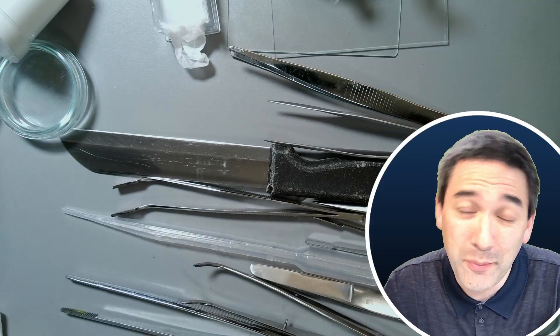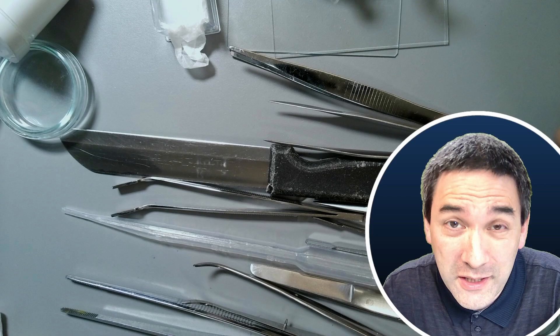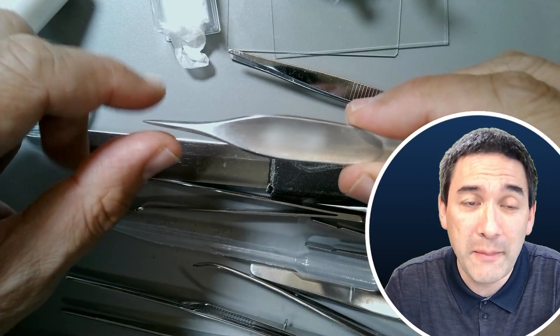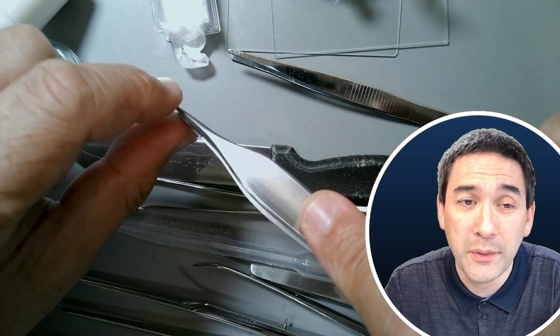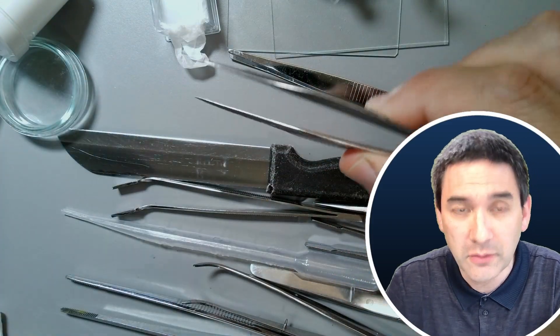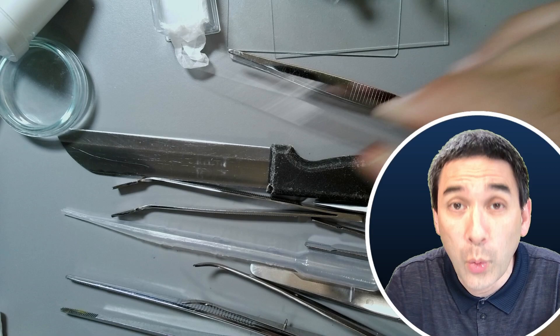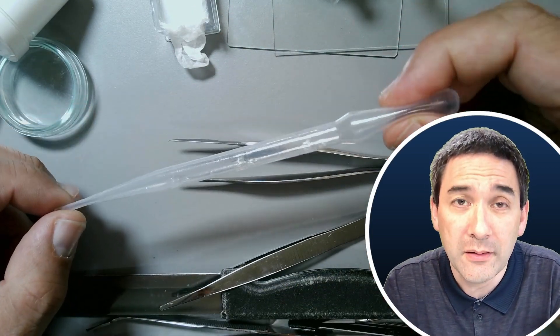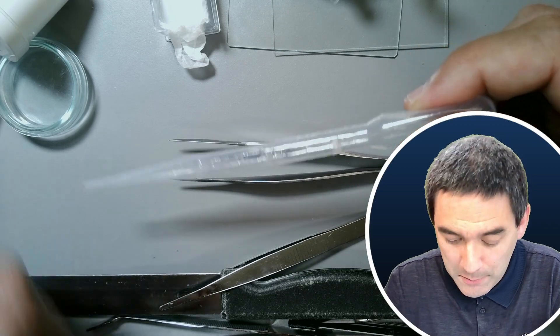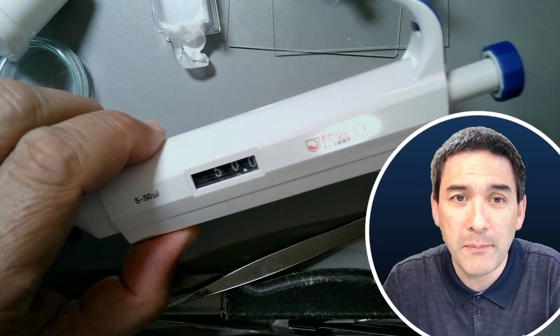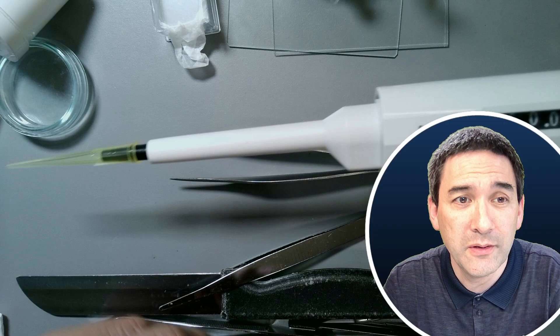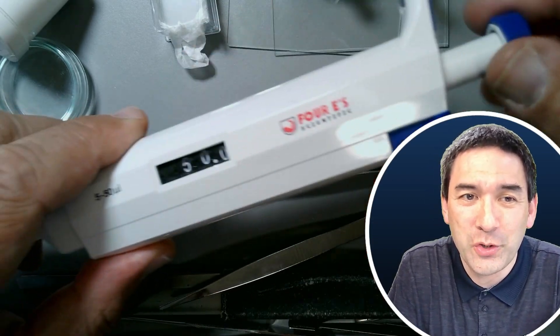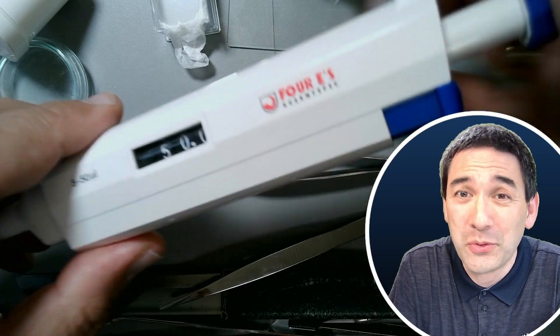In 80 to 90% of cases, you only need three different tools. I recommend you get yourself a pointed tweezer. They're quite practical because they can also be used to transfer water. The second tool I recommend is a pipette. This one is a disposable plastic pipette, but you can also get a microliter pipette. They're more expensive but look more solid. You can adjust the volume here, but that's not really important for microscopy in most cases.